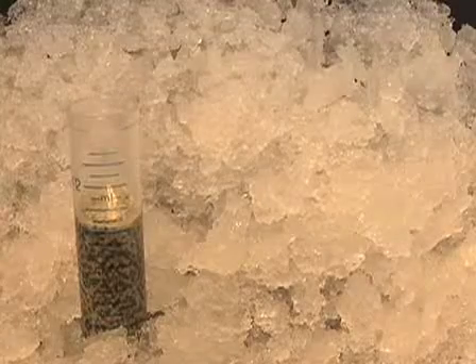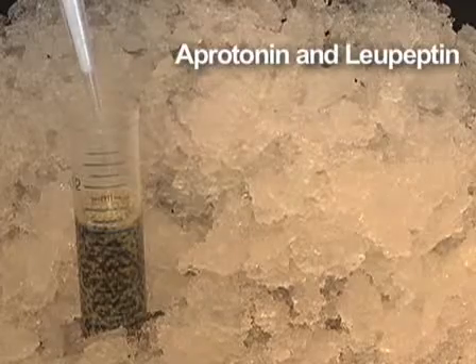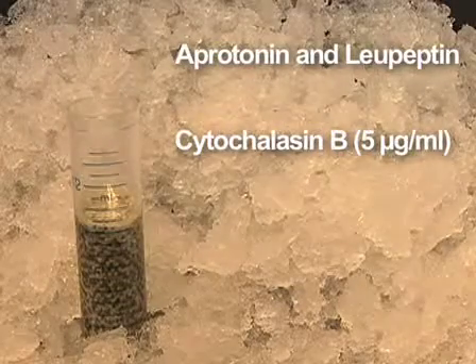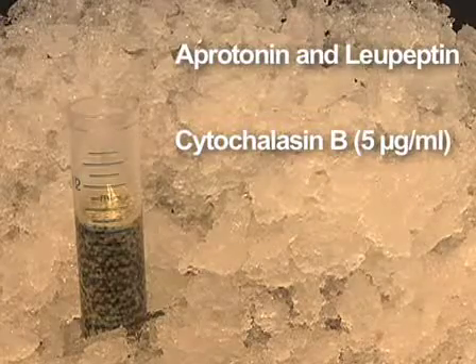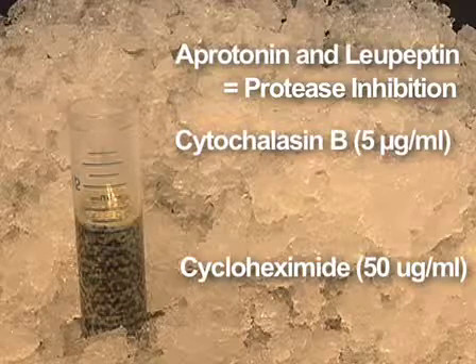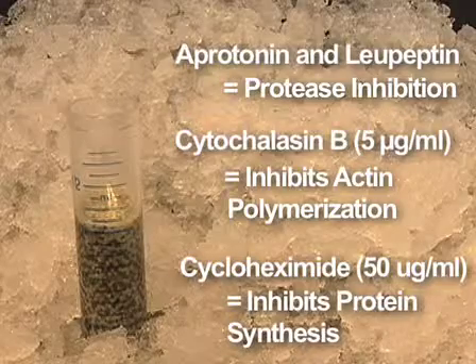Based on the egg volume, add a solution of aprotinin and leupeptin and then cytochalasin B directly on top of the eggs at a final concentration of 5 mcg per ml using 5 mg per ml stock solutions. Also add cycloheximide at a final concentration of 50 mcg per ml using a 10 mg per ml stock solution. Aprotinin and leupeptin inhibit proteases, cytochalasin B inhibits actin polymerization, and cycloheximide inhibits protein synthesis.